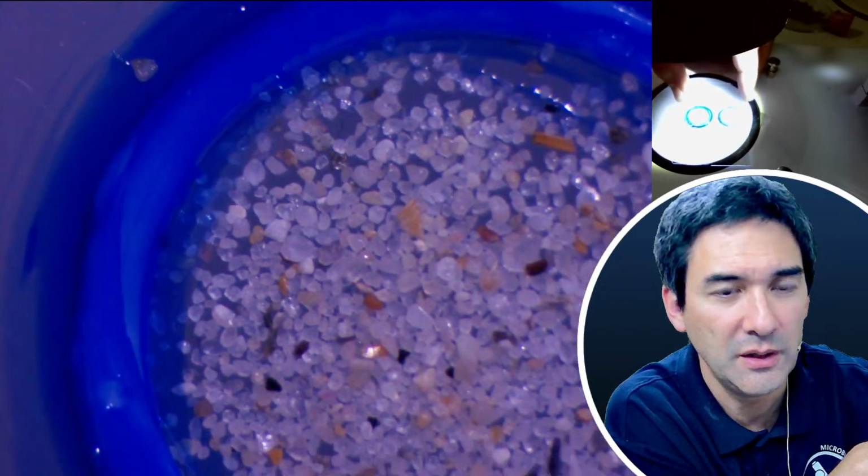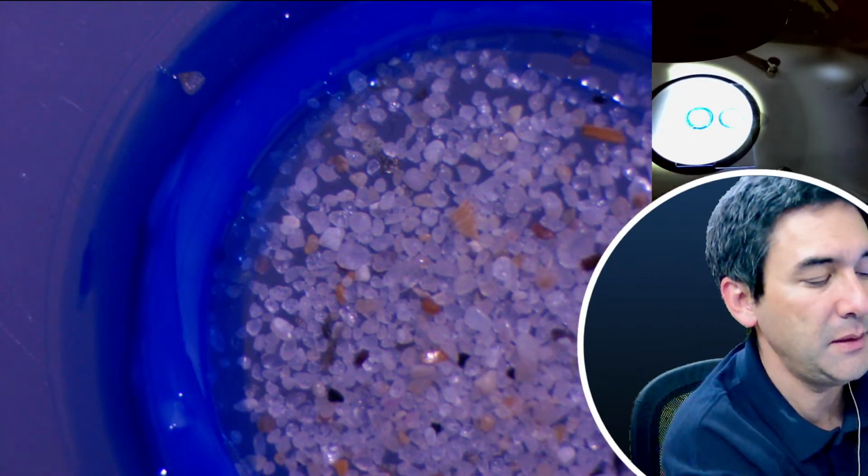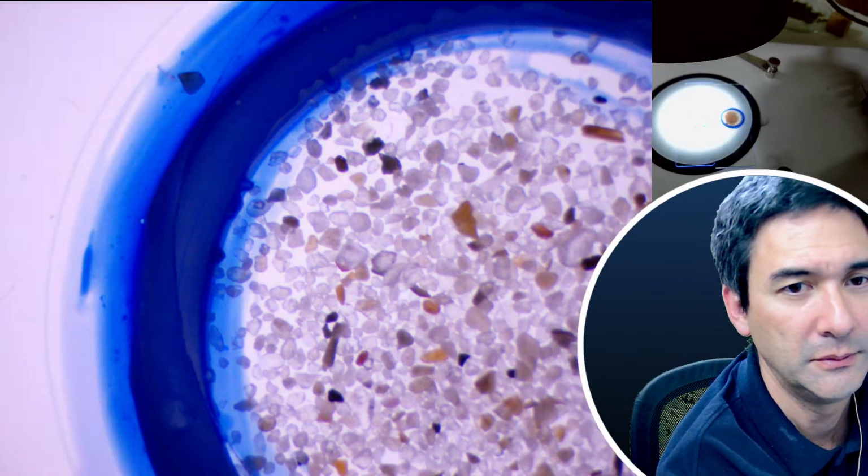Okay, and now let's try it with light from, or maybe let me see if I'm able to turn it up a little bit. No, it's already at maximum. Okay, and now with light from the bottom.